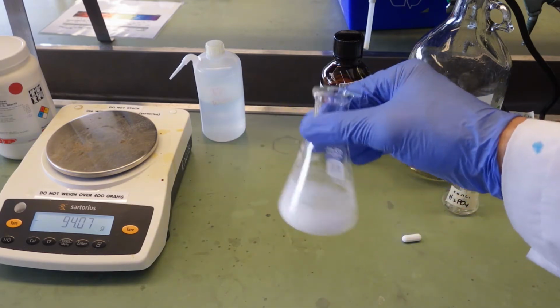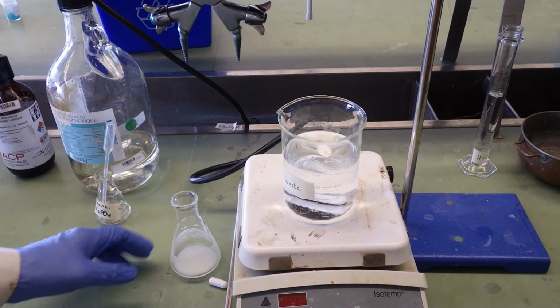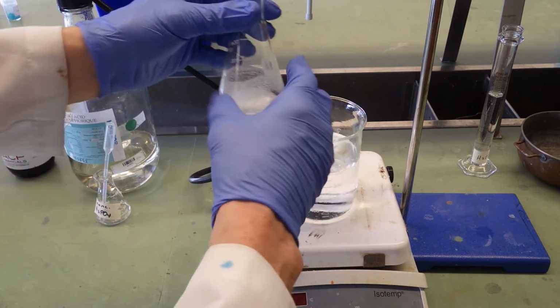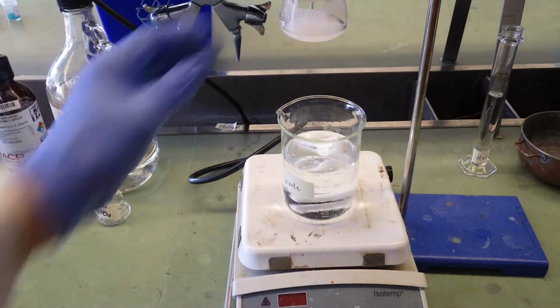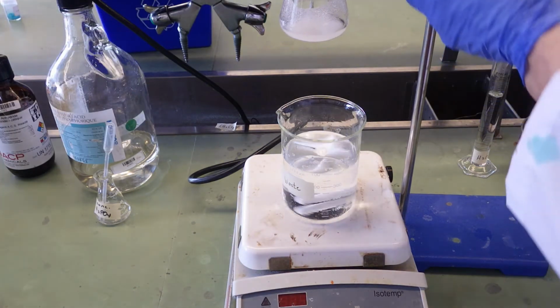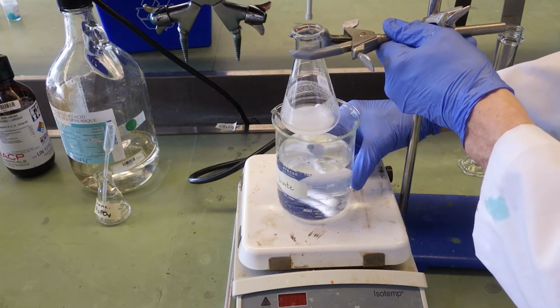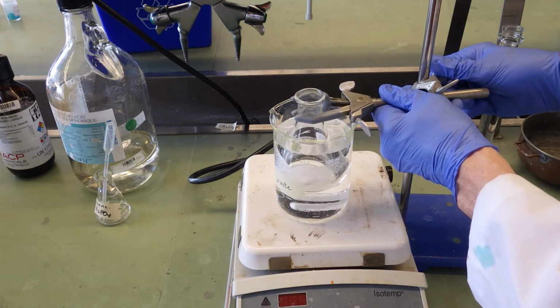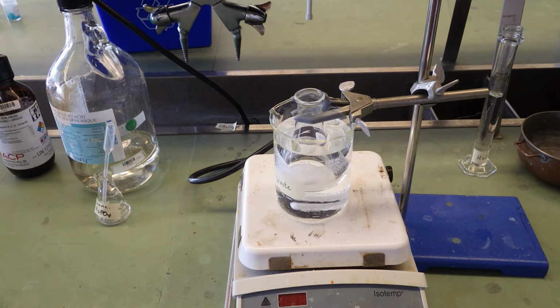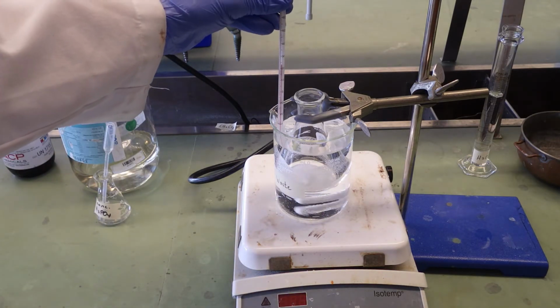Next, we'll put our mag stir bar in and transfer to a hot water bath. We'll suspend this in the hot water bath so the mixture is immersed. We're going to heat that to about 90 degrees Celsius. Once we get it at 90, we'll hold it there for at least 15 minutes to make sure the reaction reaches equilibrium. We use an alcohol thermometer to measure the temperature of the water bath.